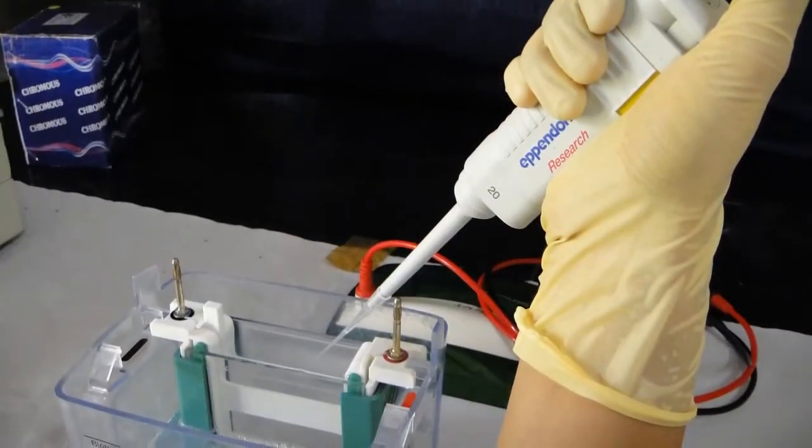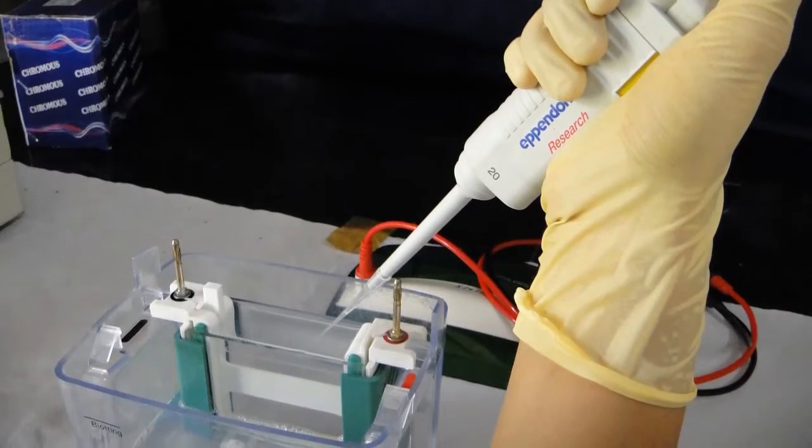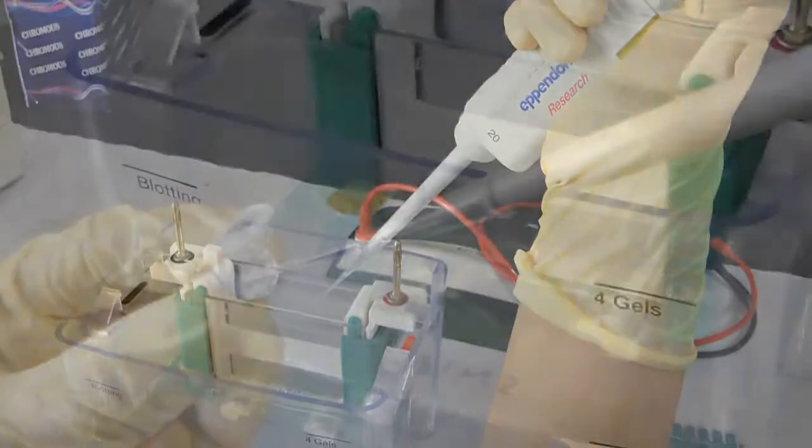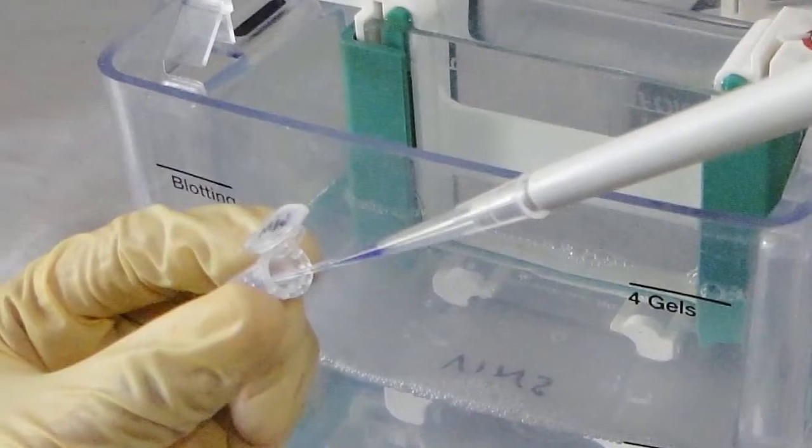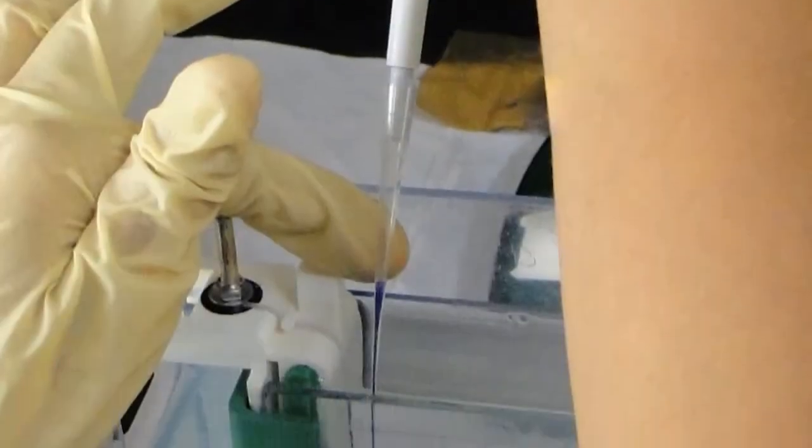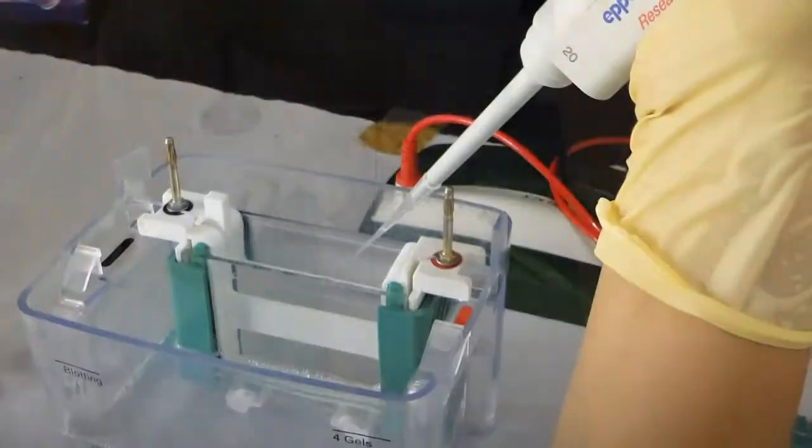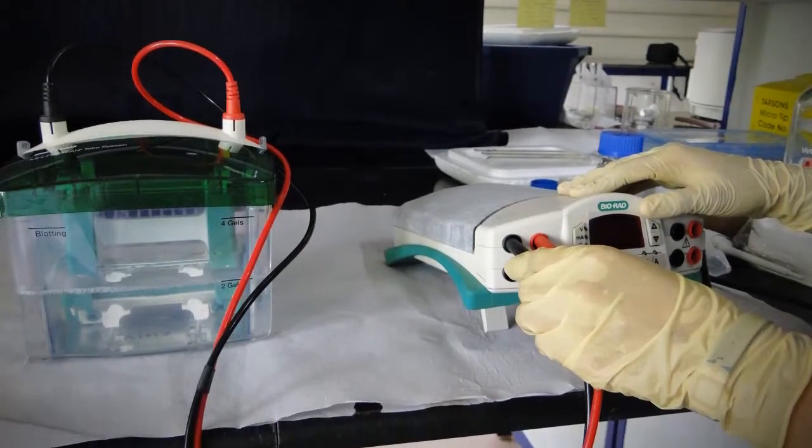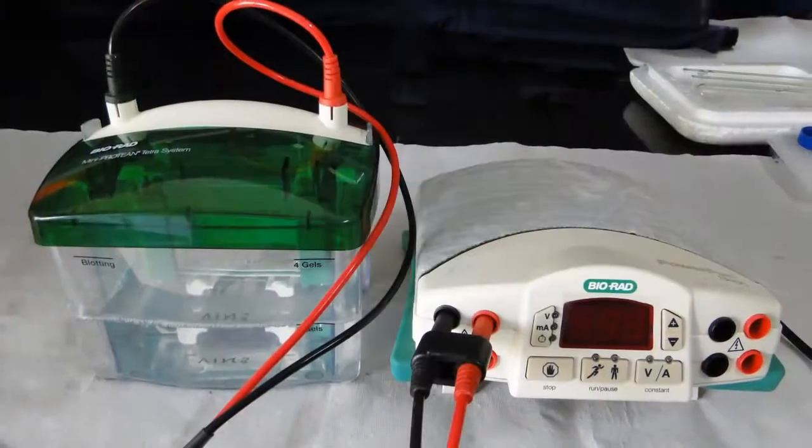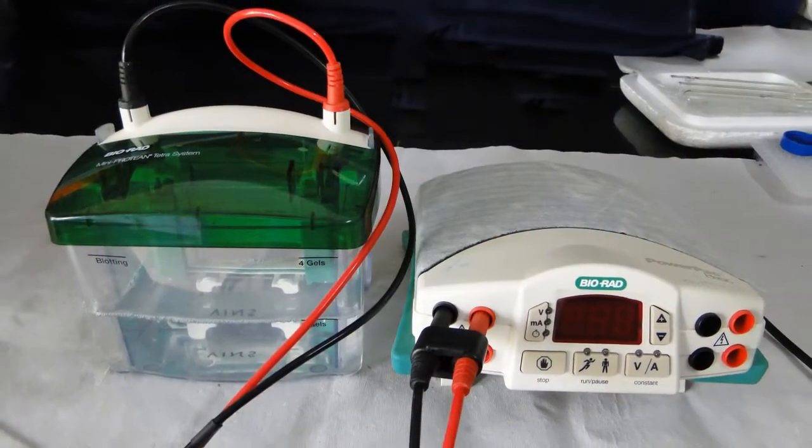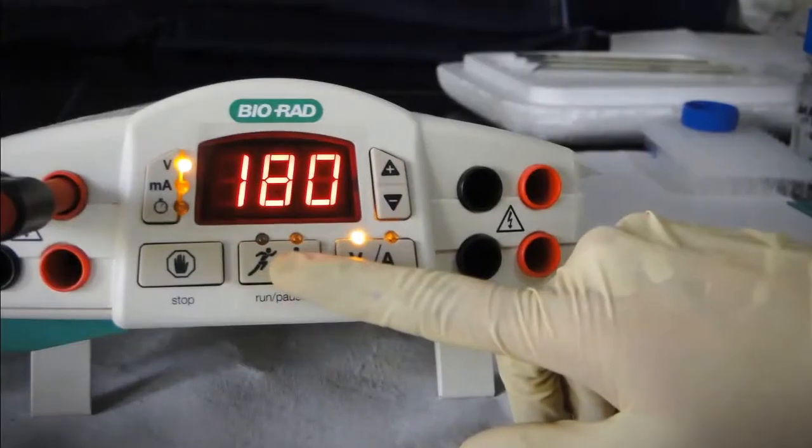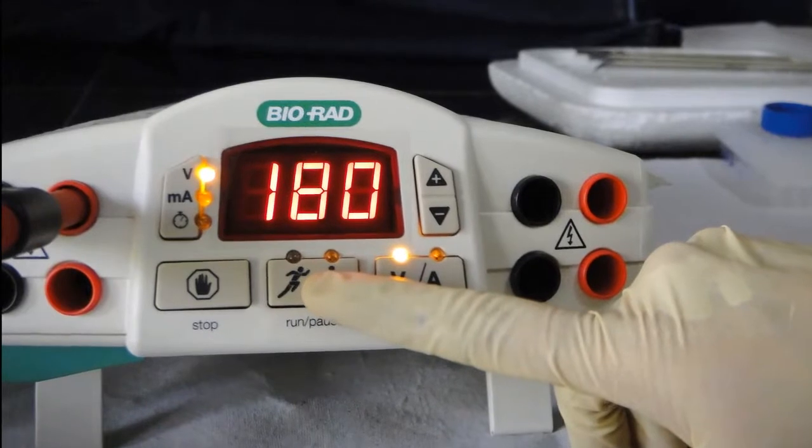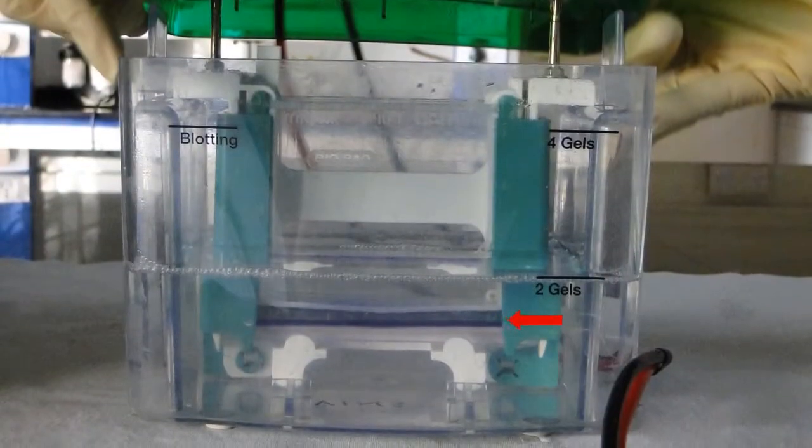Rinse the loading tip a few times with buffer. Make sure that all the buffer is pipetted out before loading the samples. Insert the loading tip to a few millimeter from the well bottom and deliver the samples into the well. Rinse the syringe a few times with buffer after loading. Attach the power supply by closing the lid. Make sure that the connection is correct, i.e., black to black and red to red. Set the voltage up to 180 volts and run for 1 hour. Don't allow the dye front to go out of the gel.